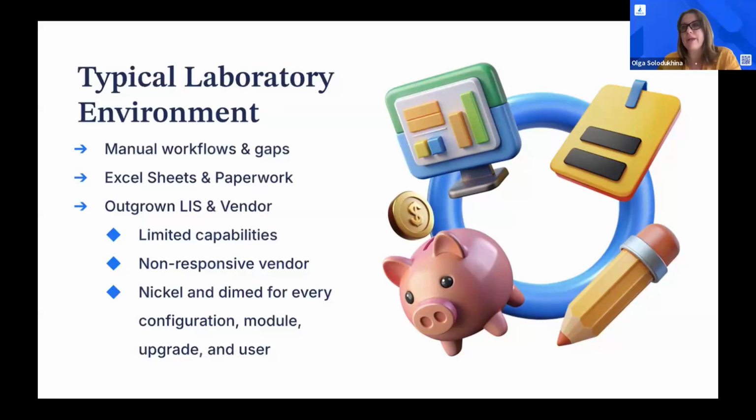We also see a lot of labs suffering from being nickel and dimed on some minor changes, some little tweaks they need to make in the system, which is not the case with LigoLab. That's really painful when you go through it on an everyday basis. We hear that a lot from our clients, and that's something we try to avoid as well.